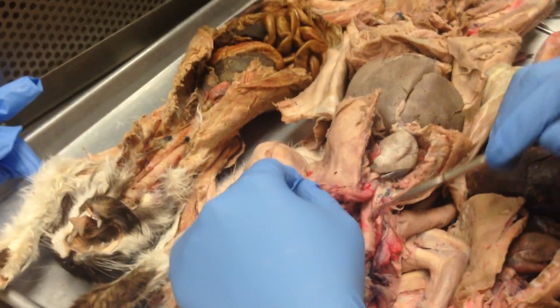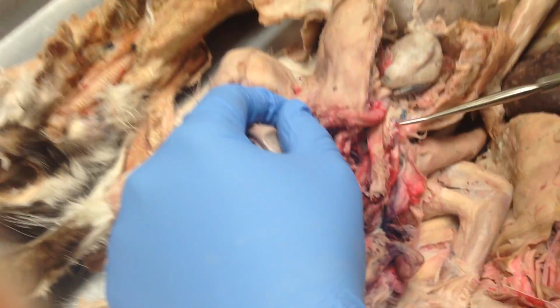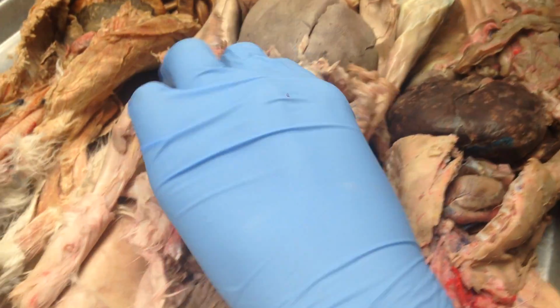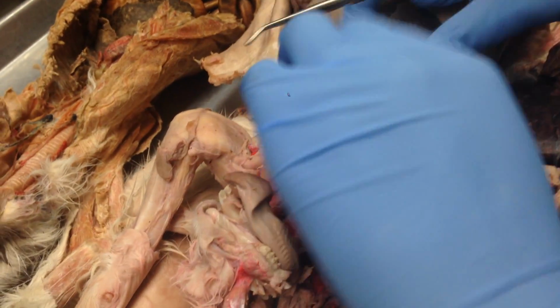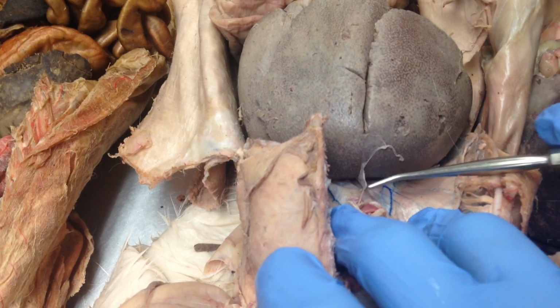So the esophagus would be right here, under the trachea. Okay. And then the falciform ligament, right here. This is the thin, fascia-looking layer.